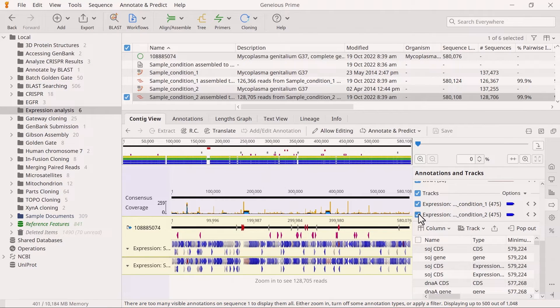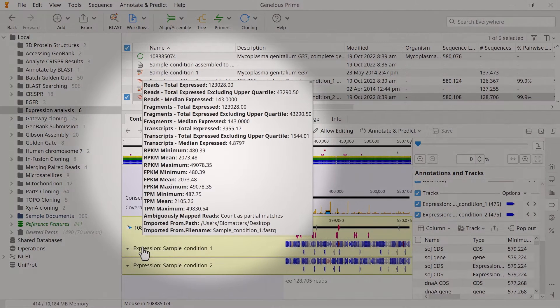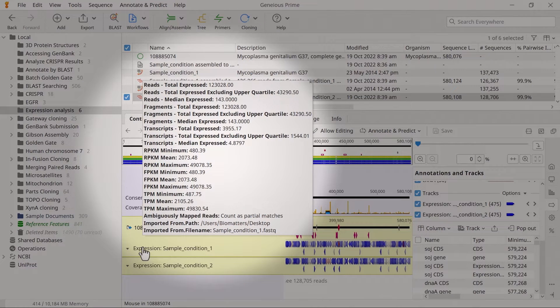If you cannot see them, check that you have enabled the tracks in the Annotation and Tracks tabs. Mouse scroll over the track name to see information for that assembly. This includes total reads, transcript and fragment counts, reads per kilobase per million (RPKM), fragments per kilobase per million (FPKM), and transcripts per million (TPM).